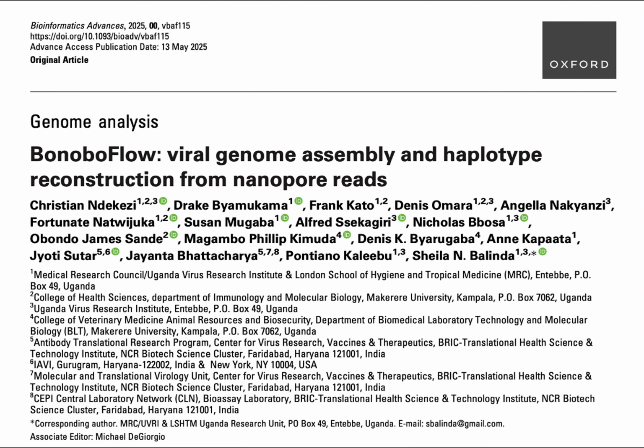So how did we start trying to map these things? What were the first hurdles? Well, the journey really began with traditional Sanger sequencing. In its day, it was reliable, but it was expensive. It had limited sequencing depth, meaning it couldn't read very far into the genome in one go. And low throughput. You couldn't process many samples quickly. So for large-scale studies trying to track viruses evolving across populations, it was just impractical. So it worked, but slow, costly, couldn't keep up with the sheer scale of viral diversity.